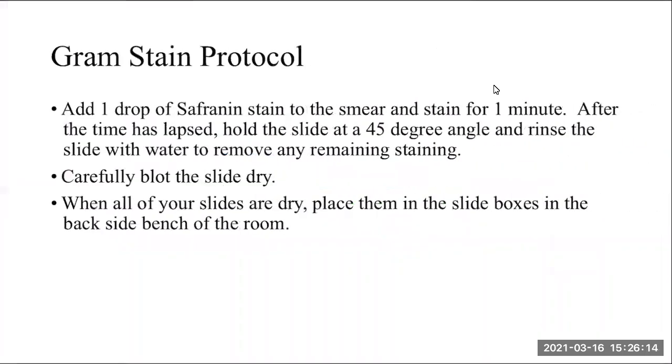Finally, the last step is to add 1 drop of safranin to the smear and stain for 1 minute. So that's your longest step. After the time has lapsed, you hold the slide again at the 45-degree angle and rinse the slide with water to remove any remaining stain. Finally, you blot the slide dry, again being careful not to touch the target area, and then allow the slides to air dry for about 5 to 10 minutes.